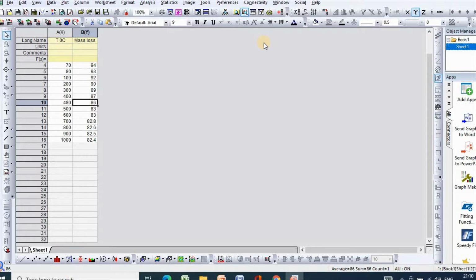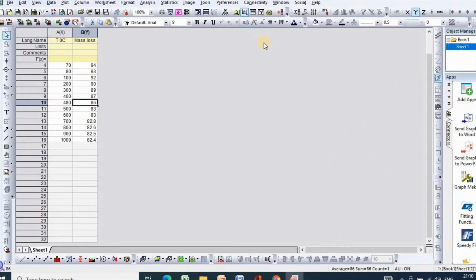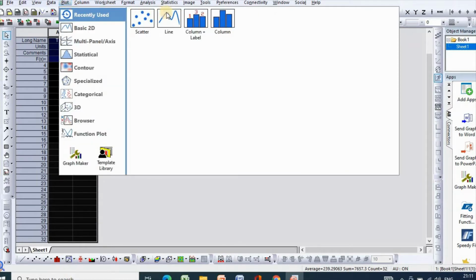In this video, I will show you how to draw a thermogravimetric analysis plot using OriginPro. So in order to do that, I have taken TGA data for birnessite or delta manganese dioxide, then select, then click plot, then click line.